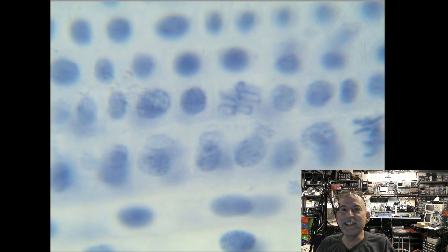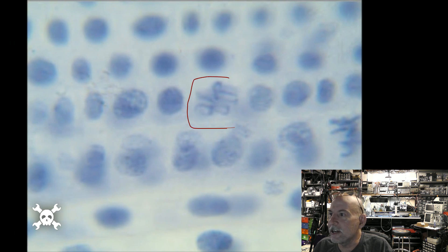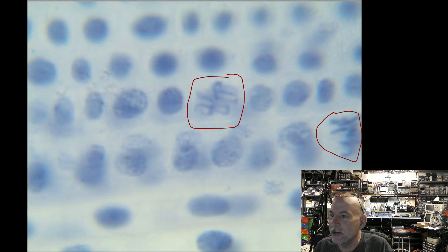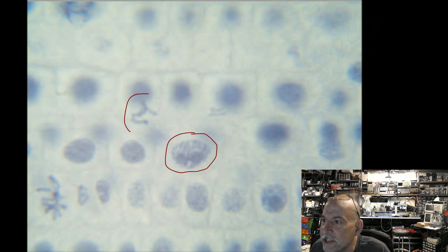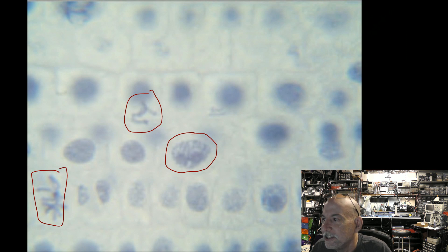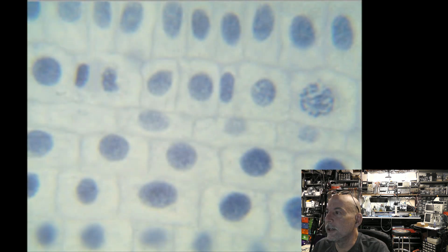The first slide — I see stuff! This is so cool to see with your own eyes. Look at this guy, he's getting ready — you can see the tubular structures in here. It's definitely something going on; this might be a metaphase. Let's keep looking at our slide. Look at this — I see two nucleuses in there, and again we see things where the chromosomes are coalescing. Here's one pulling apart right there — here's one actually pulling apart, becoming two cells. This is why we're alive — our molecules have the ability to do this. There's an anaphase going right there, and there's an early stage where it's just entering the mitosis stages of replication. That's still cool to see it getting ready.